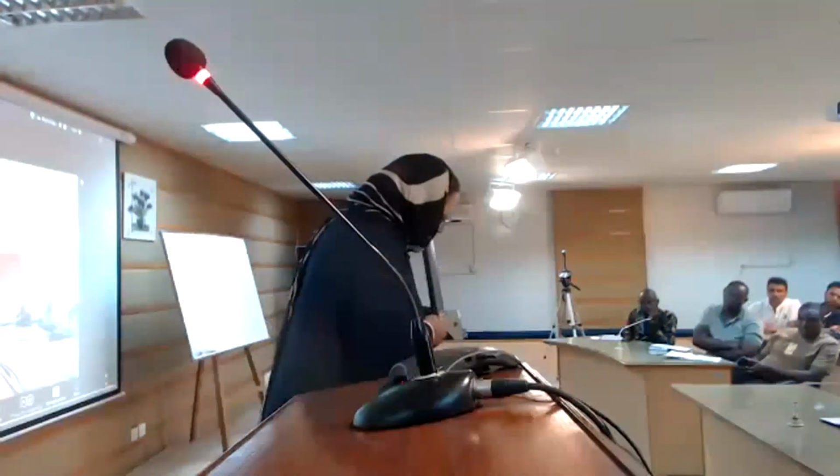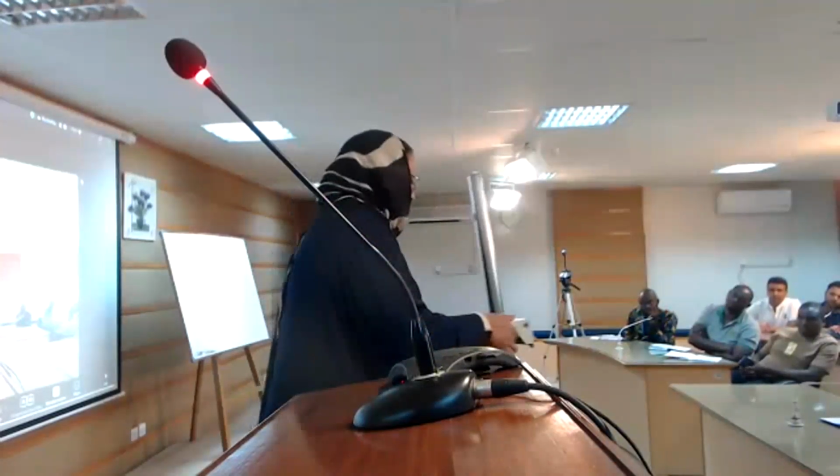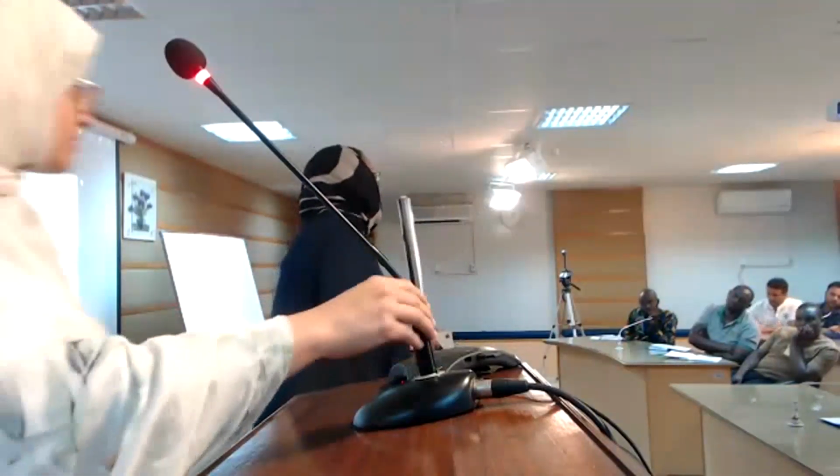There are outside amplifiers and other things, but the main function is all in this small probe. We have many different types of probes, and you might look at the website of ICCVS to see the various kinds. This is one example, and your sample goes deep inside it.